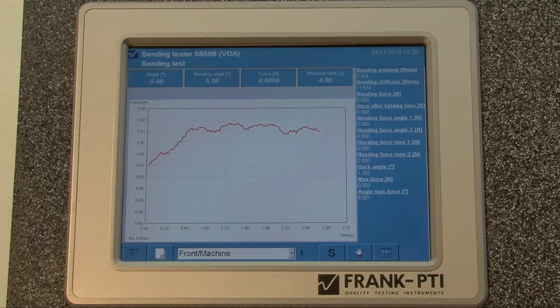Now you can start some more tests by changing the sample and pushing the start button again. All the results will be shown on the screen in different colors so you can easily compare your results.